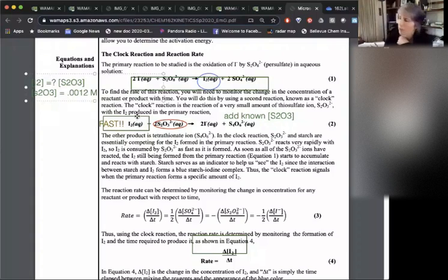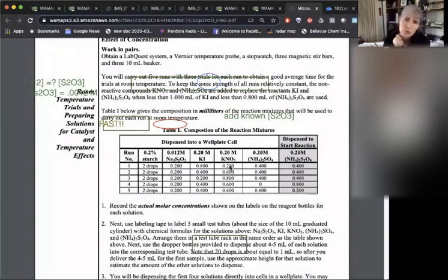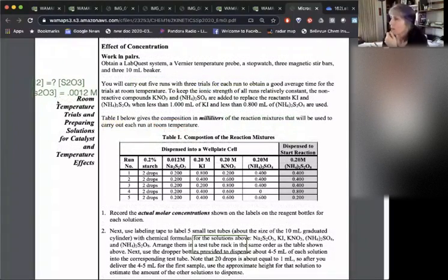Right, I'm using that chemical equation. We know how much thiosulfate we added, and then there's maybe a dilution issue there. 0.012 molar times 0.2 milliliters over a total volume of 20 mils. Are these really 20 mils? Oh no, this is older. So it's 2 milliliters. It's not 20 mils anymore. So our total volume is 2 milliliters each time.